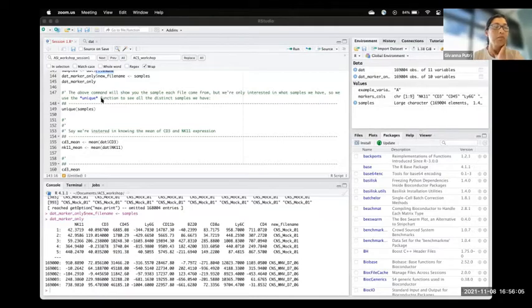Oh, good. Okay. The other thing that I thought was, sorry about that, interruptions. The other function that I thought might be useful is this function called unique. As the function name already alludes to, it will try to isolate just the distinct elements within a collection of elements.